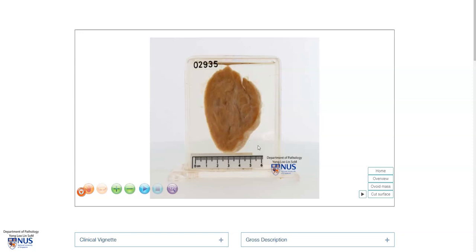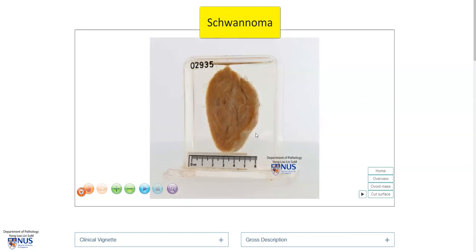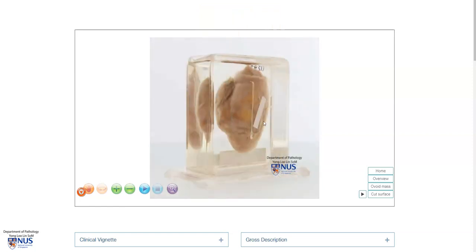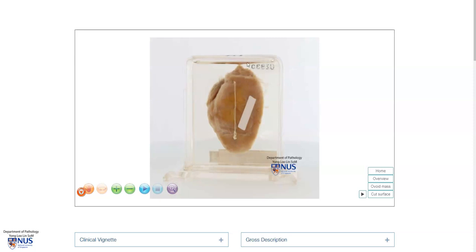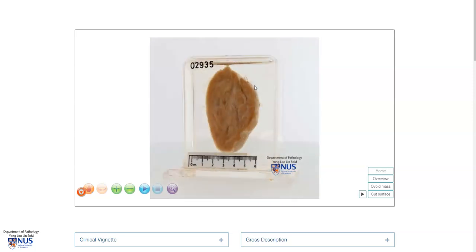Hello, this is a virtual pathology specimen of a schwannoma, and this is a benign nerve sheath tumor. We can see that it is very well circumscribed. It is ovoid in shape, and this is the outer surface. In this case, this tumor appears to be encapsulated. We do not see the parent nerve, but sometimes we can see the original parent nerve from which it arises at the edge or the periphery of the lesion.